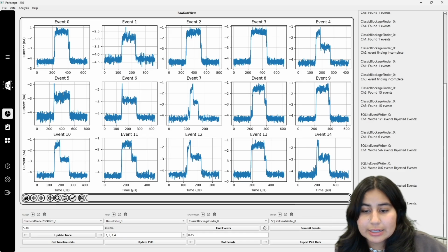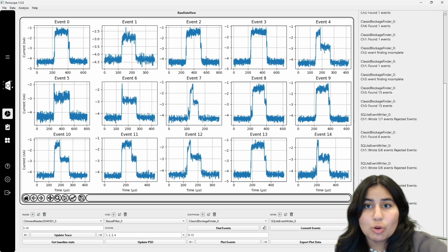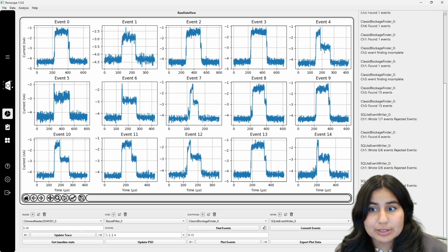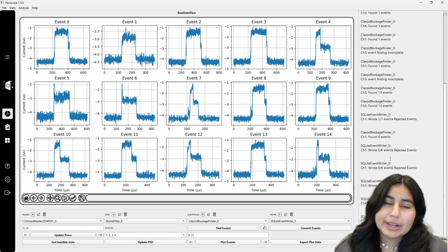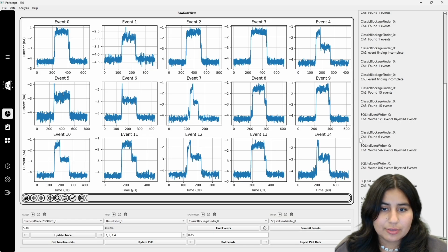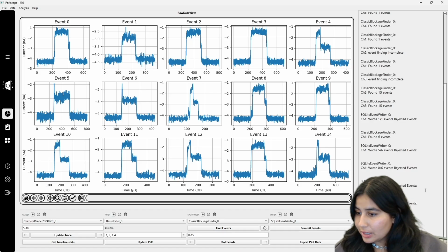As you see, even though the last time we ran the event finder, it was only for channel 3, the previous runs with the different channels were stored, so we don't have to rerun it every single time before we save them. What happens is it's gonna keep the last effective run that we did with the finder, and if we wanna write it, it's gonna write that last effective run of the finder we did. And if we keep writing the same and the same, it's not gonna get overwritten.